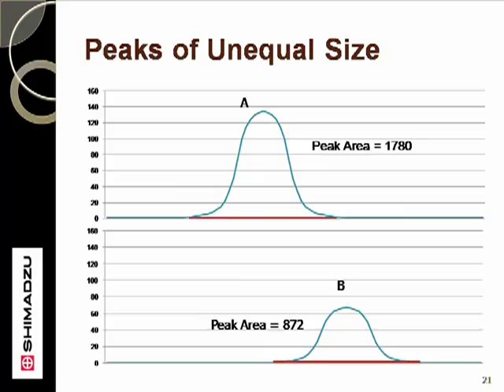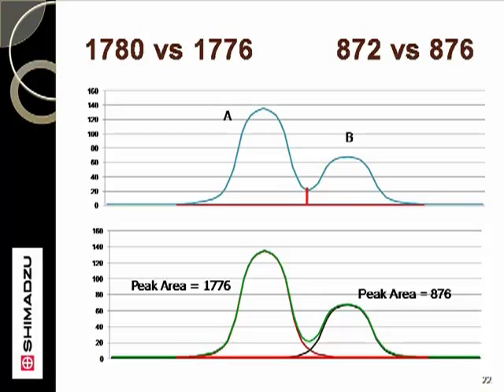Let's now look at a similar comparison, though with differently sized peaks. In this case, the A peak by itself would generate an area of 1780, and the B peak would generate an area of 872. When the peaks are nearly separated, there is a small shift in area toward the B component. This is caused by splitting the peak at the valley and having a larger trailing edge from the A peak contribute to the B peak area. While the shift is only small — only 4 area counts in this case — it would be worse if the smaller peak were smaller still.